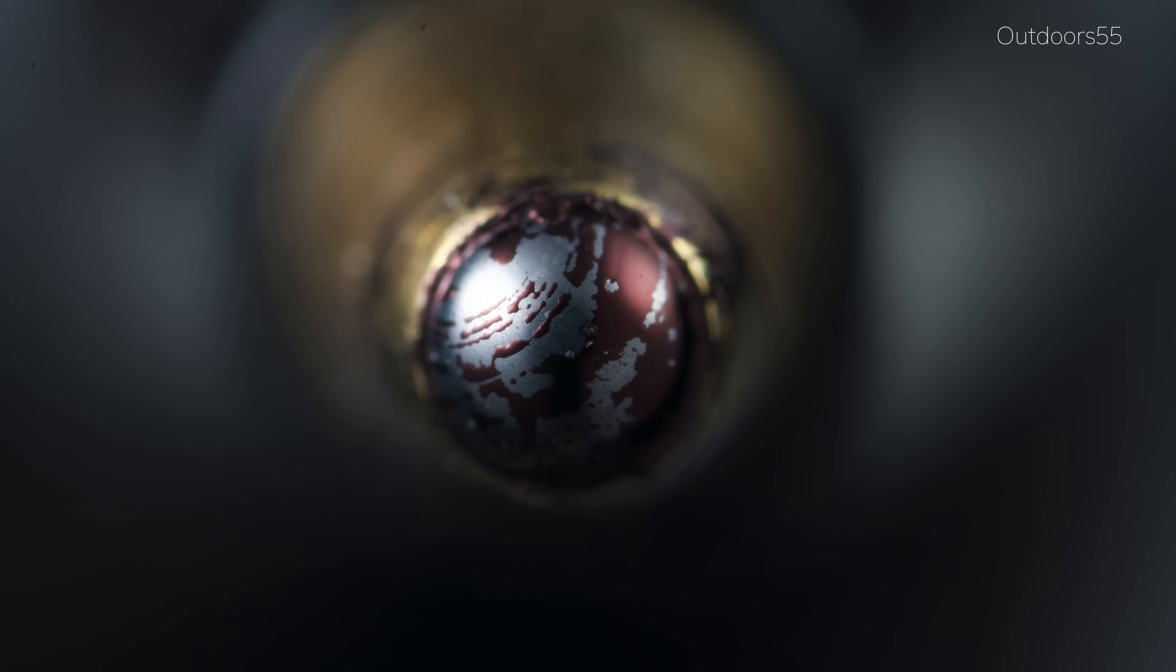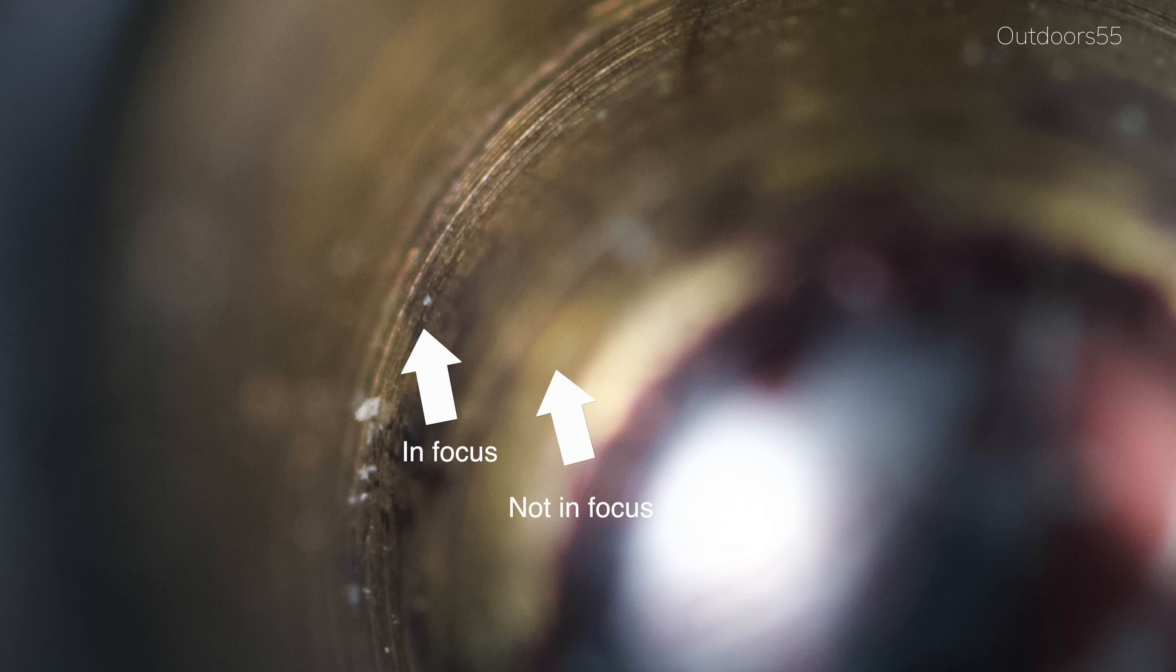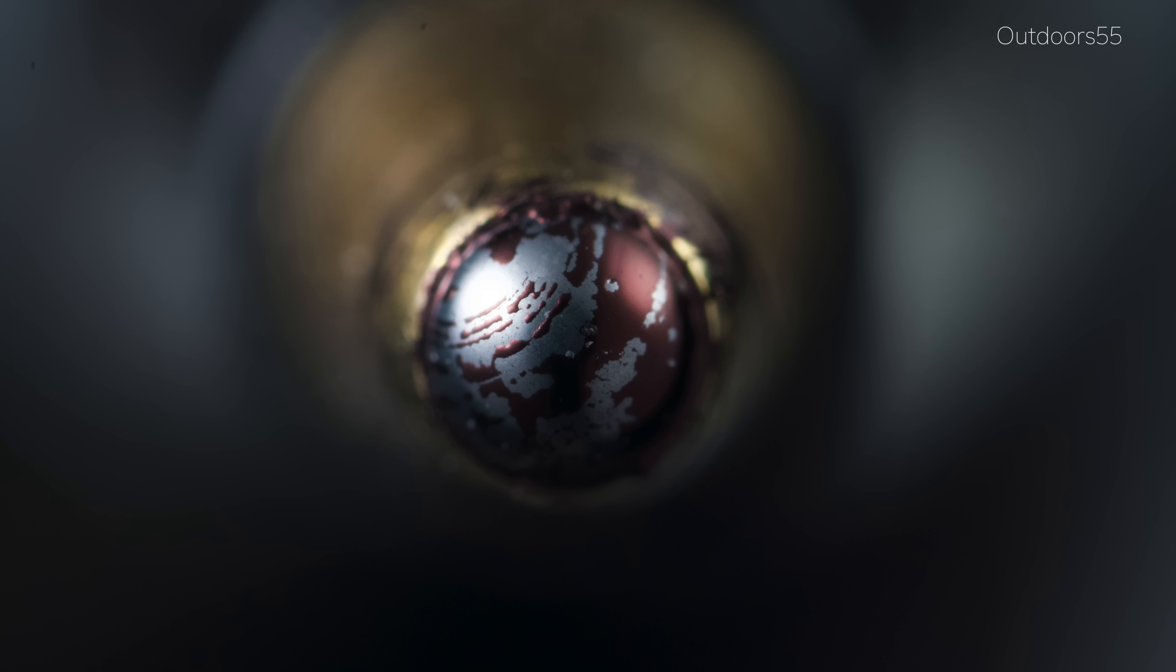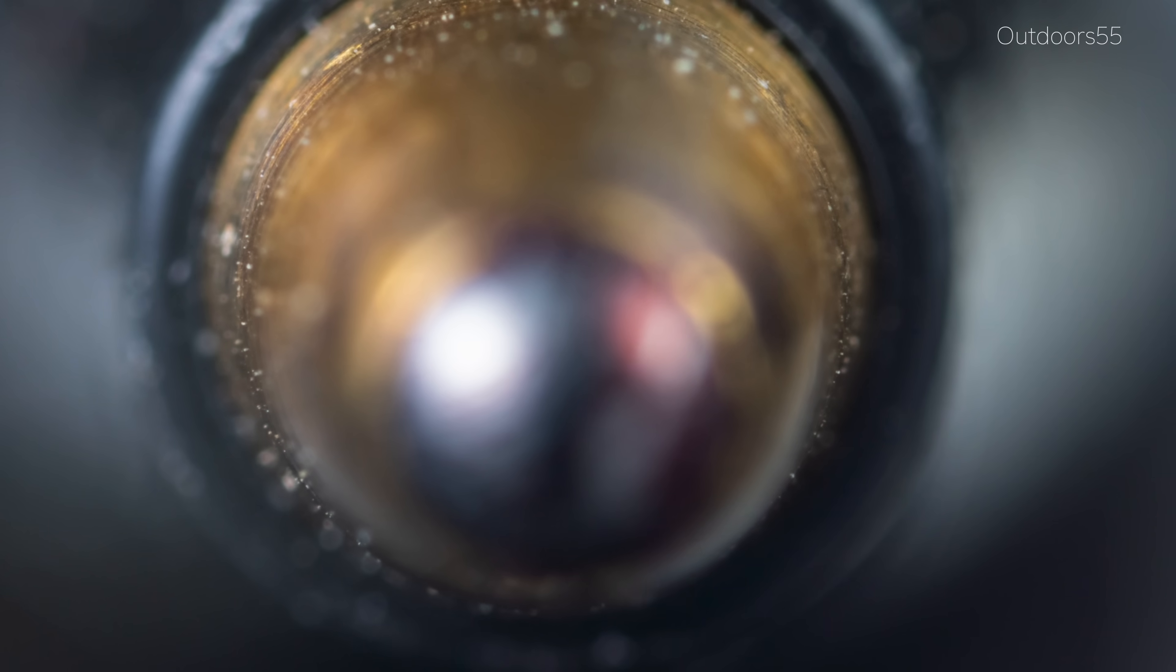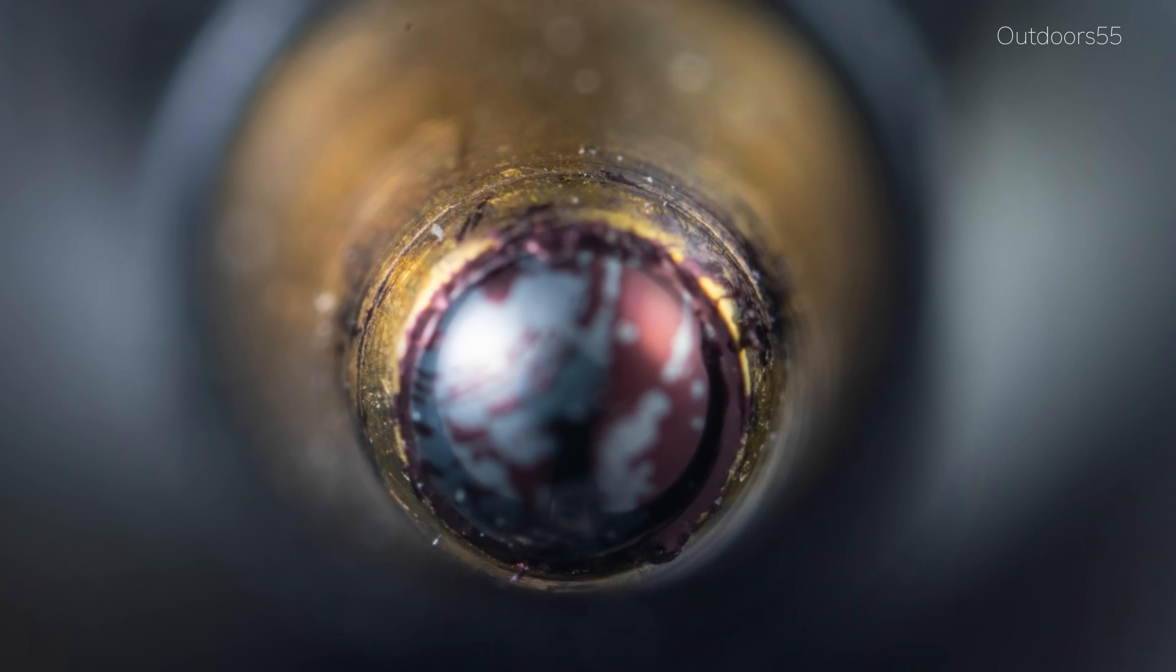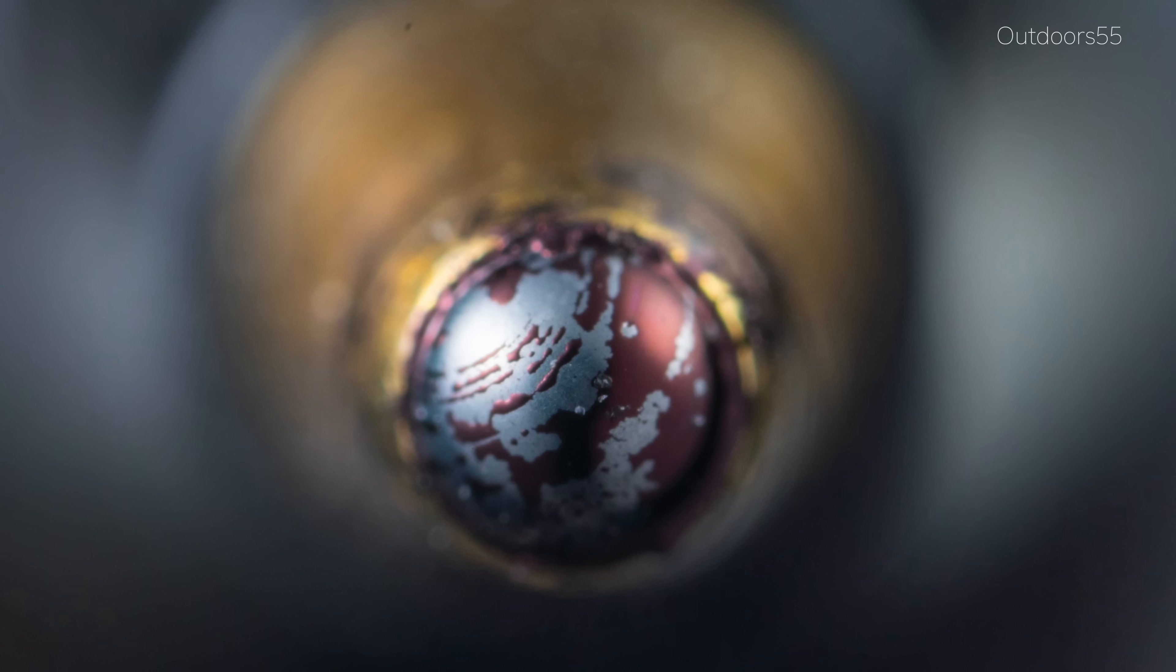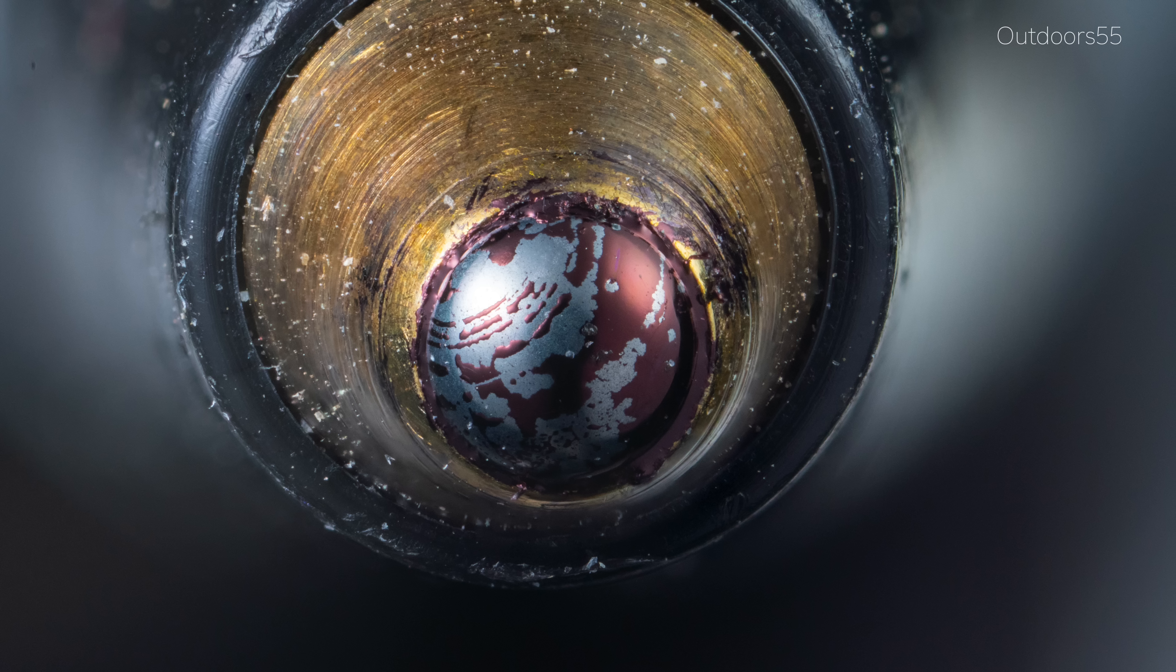And yet again, trying to not go down another rabbit hole, depth of field is basically the area of the image that is in focus. Using higher magnification means the depth of field gets smaller, or the area that is in focus gets smaller. So when viewing some items like this pen, only the very tip of the pen ends up being in focus. Now we can actually fix this issue using something called focus stacking, which basically means we take a bunch of images in sequence with different parts of the item in focus for each image. We then stack these images together using software to get one single in focus image. Like this one, where we combined about 95 individual images and combined it together into one complete in focus image.